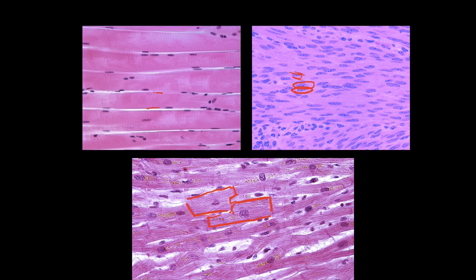You need to look at the shape of the cells, but you also need to look at the cell nucleus. Skeletal muscles are going to be multinucleated — they have many nuclei as you see here — while cardiac muscles are only going to have one nucleus. The same goes for smooth muscles, only one nucleus. You also need to look at the shape of the nucleus. You can also notice those alternating black and white stripes in the skeletal and cardiac muscles — smooth muscle doesn't have that, which is why it's called smooth. That's just one example of how to differentiate between cells in histology.